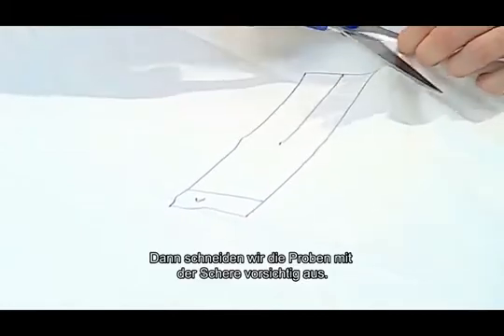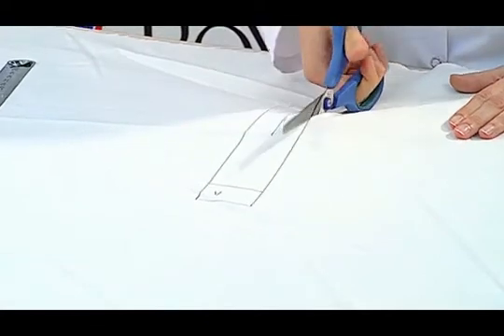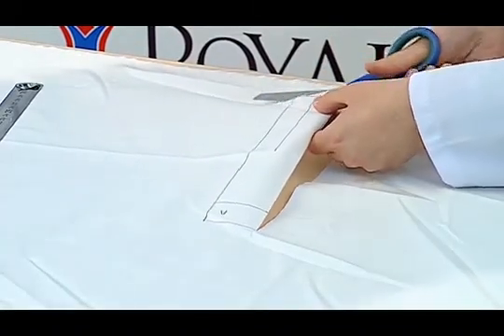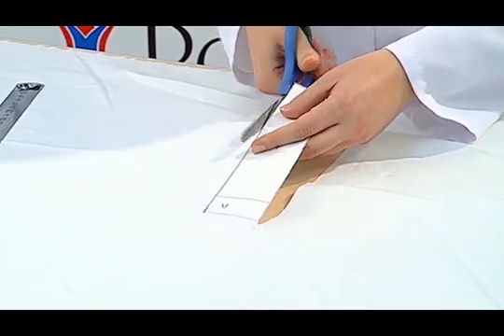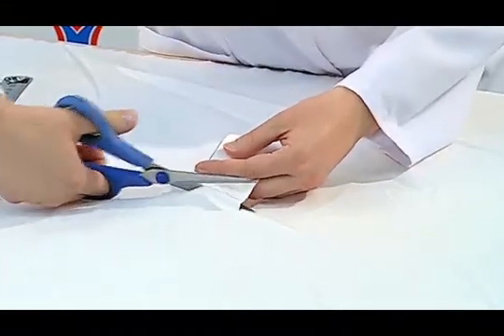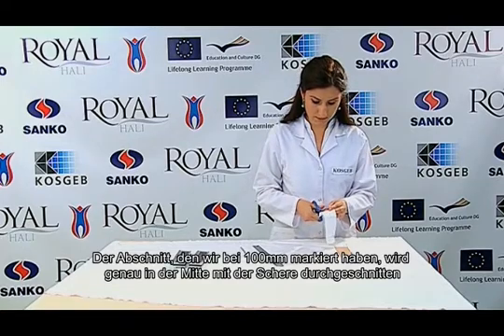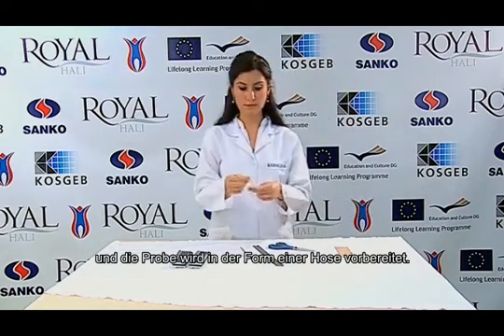Then we cut the specimen with scissors properly. The section marked at 100 mm is cut right in the middle with scissors and the test sample is prepared in the form of trousers.